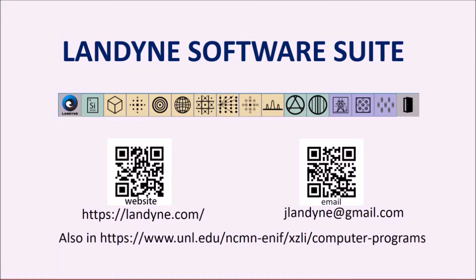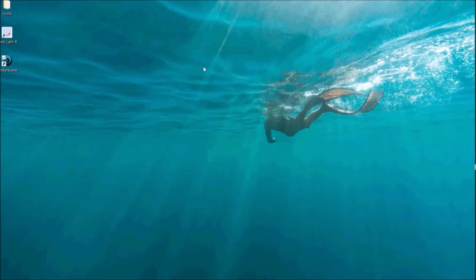Welcome to the CTFscope. CTFscope is for simulation and visualization of a contrast transfer function. This is one of the software in the Landyne series. You may download the Landyne Suite on the screen. In this video, I will introduce new components. You can start the Landyne launcher here.